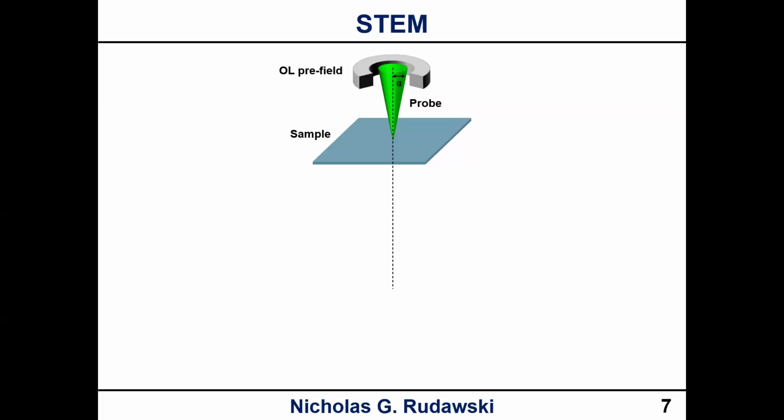In terms of where you're actually focused, it can depend on a few factors. This is where simulations come in to help make sense of this, because there has been some simulation work that looked at what happens if there is a damage layer on the surface. What they determined is that if there's a damage layer on the surface, your optimal focus state is actually slightly underfocused rather than focused right on the surface, because of the presence of the damage layer.